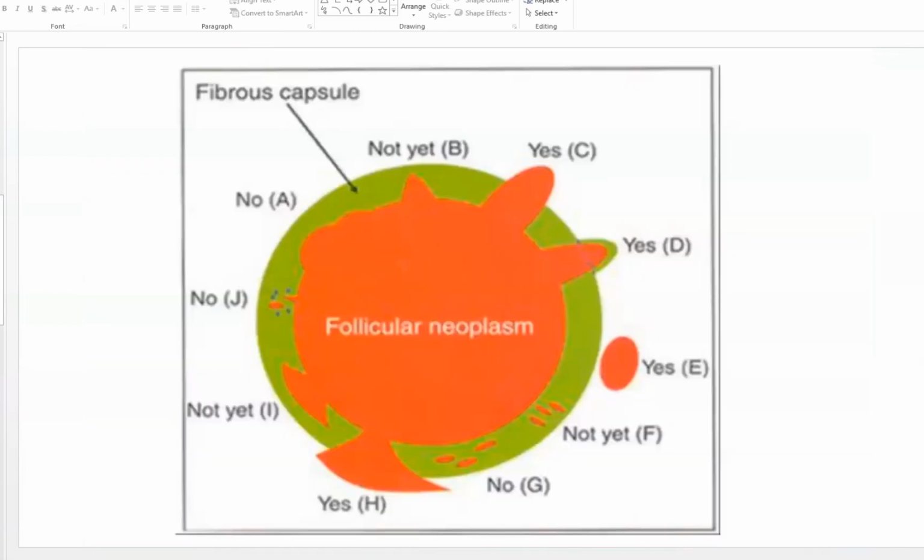And the reason that's important for follicular lesions is that capsular invasion is a key determinant on whether you're going to call this a carcinoma or not. And there's different histologic criteria for what amounts to capsular invasion. So it's all outlined in the College of American Pathologists protocol. So it's important to document this, and you can only fully document this by sampling the capsule in its entirety. That's why we keep drilling on this idea that you have to sample the capsule as much as you can.